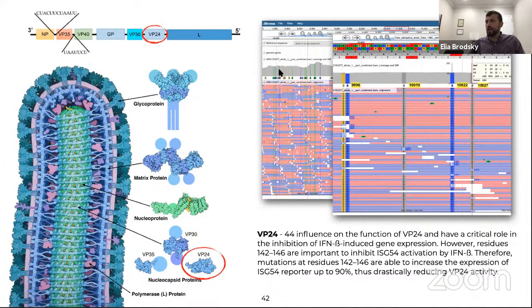So somebody previously had a question about coverage. Right here in the gray, you can see the coverage. Right here in the bottom, you can see the actual reads. So if we just visualize our data, we can look at the reads, but we can also ask, well, altogether, how many reads are aligned to each position, which gives us a lot of different confidence measures for how we can be confident in a particular change.